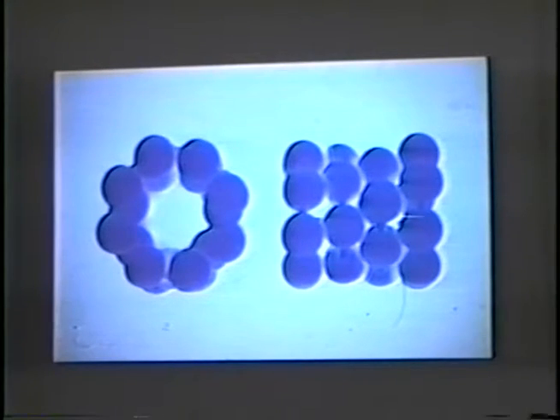Turning now to the protein cylindrin, also termed the multi-catalytic protease complex. Here we have a model of the cylindrin molecule, orientated on end and on its side, giving you some indication of the subunit composition. The molecule has a reel-like composition, possibly with 8 subunits in the outer ring, and indicated here, the thinning with possibly 6 or 7 units in the 2 central rings. This is certainly open to question at the moment.